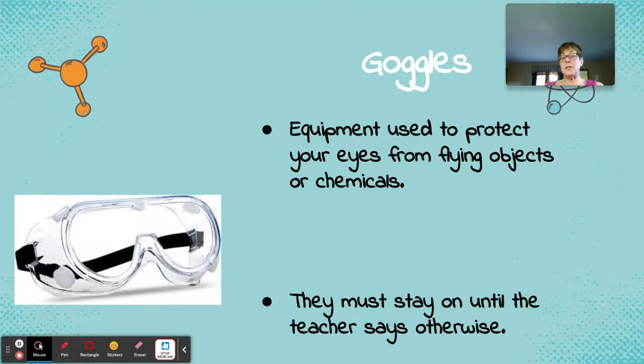Goggles, we know what goggles are, right? They are used to protect your eyes from flying objects and chemicals. And if we have to use goggles, you have to keep them on the whole time until your table group puts away and cleans up, okay? If you take them off, there will be consequences, okay? Remember, safety is the key. We're not going to do labs unless I can guarantee your safety.